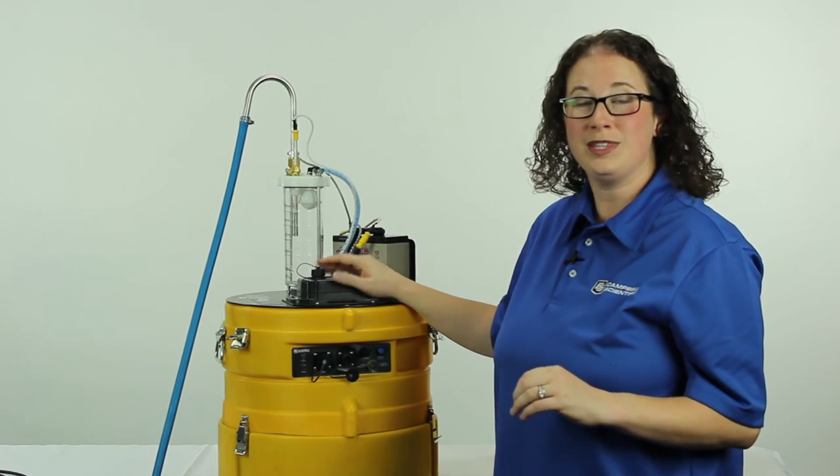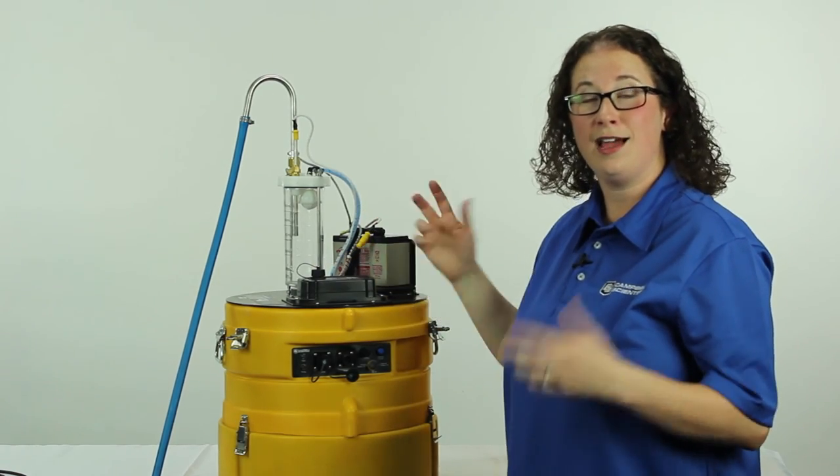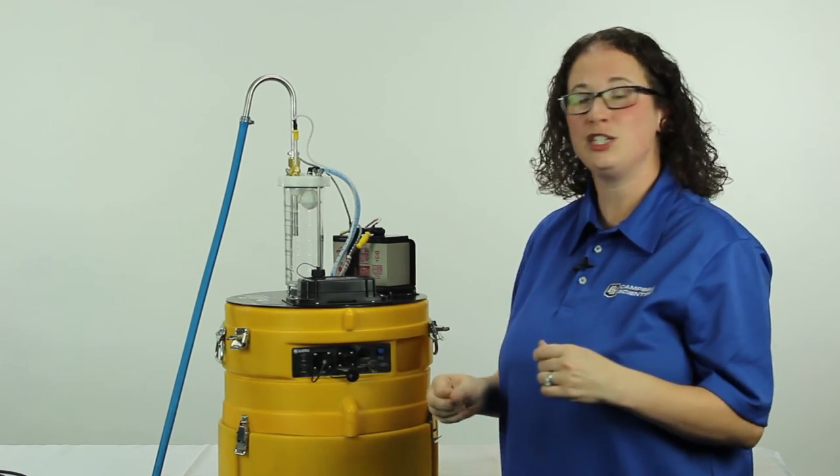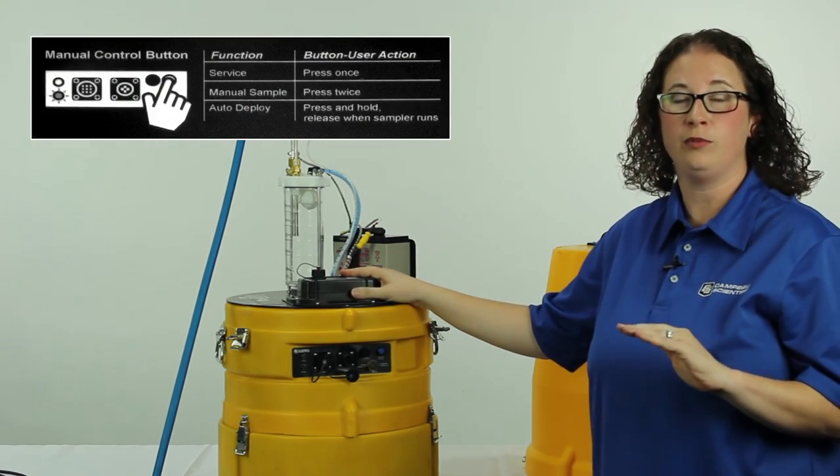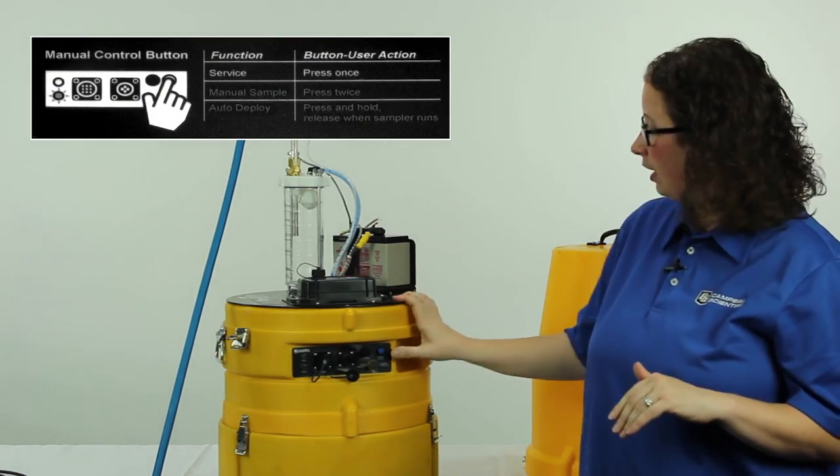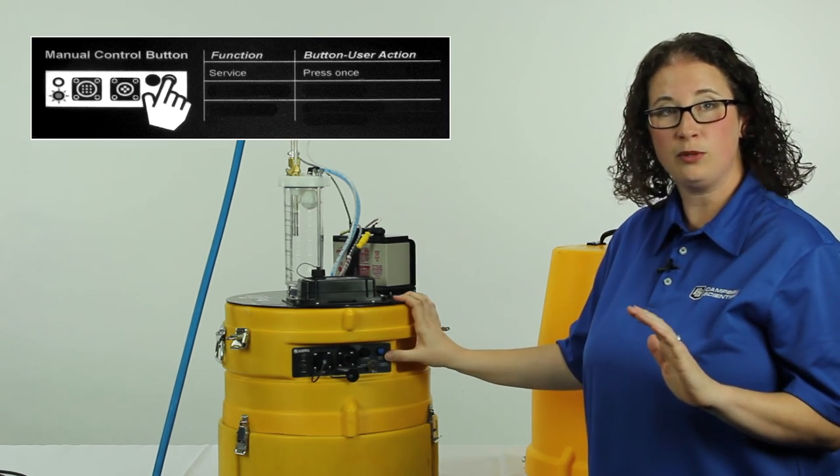We've emptied our bottles, but the sampler still thinks I'm on bottle number two, so we need to use another function for the manual control button, which is servicing the sampler. By pushing and releasing the manual control button, you tell the sampler it's empty and to go back to spot one.